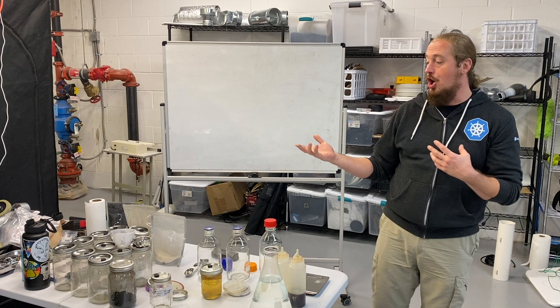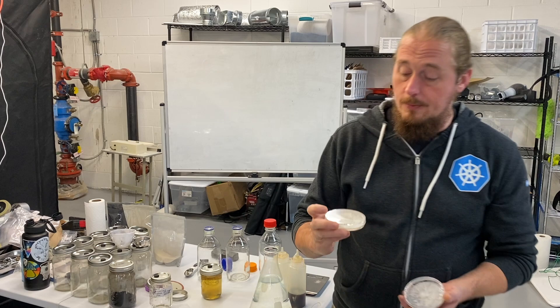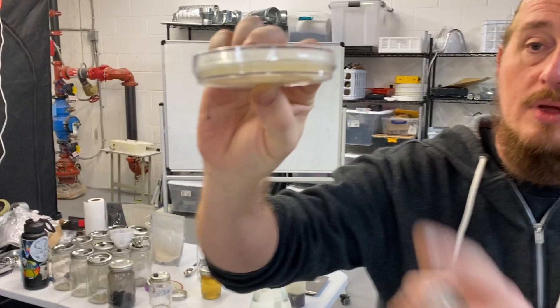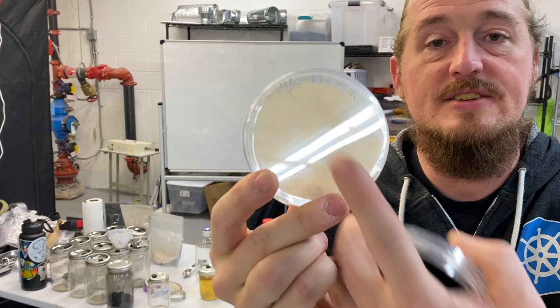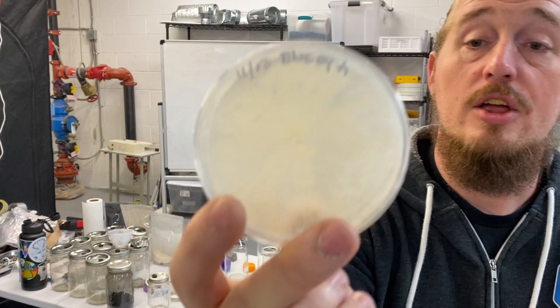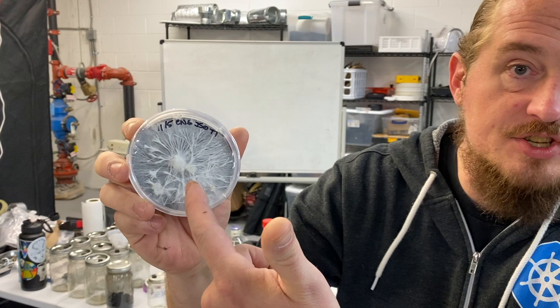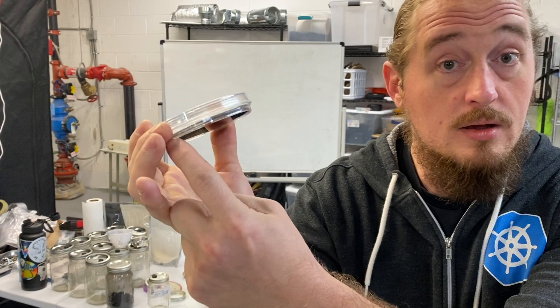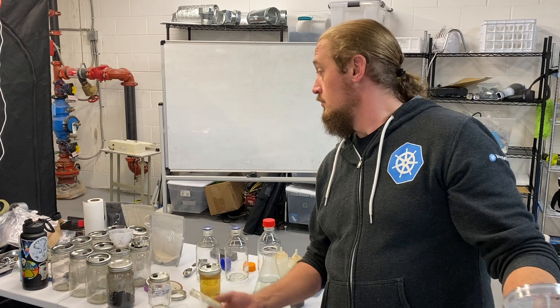First, let's back up — in the first video I didn't necessarily show you what we're talking about. This is an agar plate. As you can see it's got this nutrition right here — this is the agar powder — and in this case this is sorghum syrup agar. I inoculated this with a transfer from another agar plate of a blue oyster; you can see it's all nicely grown out. Here's another one with different recipe — you can see it's all beautifully spread out with great growth sectors. This one is black: it's sorghum agar with just a couple grams of charcoal added.